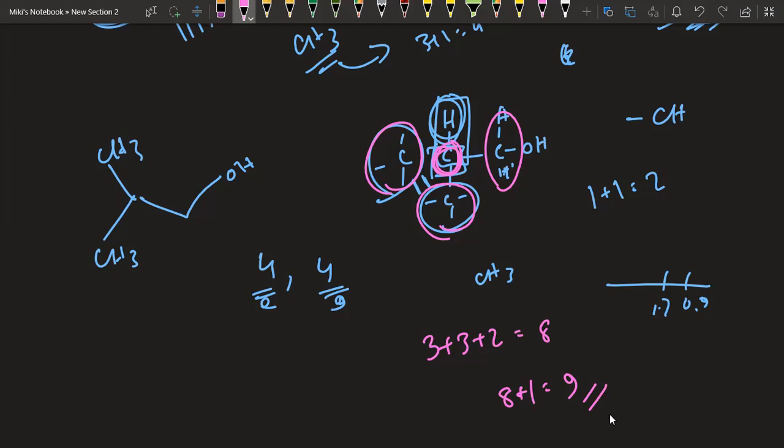Okay. For the central carbon. Now coming back to this carbon, how many adjacent carbons do we have? 1, this one, and it has how many hydrogens? 1. That means here also we have a doublet. Okay, got it. So we have 2 doublets here and 1 multiplet: 1 multiplet for the central carbon and 2 doublets for this one and this one. Finally, we have this individual alcohol group. That alcohol group will give a singlet. Okay. So that's basically it.